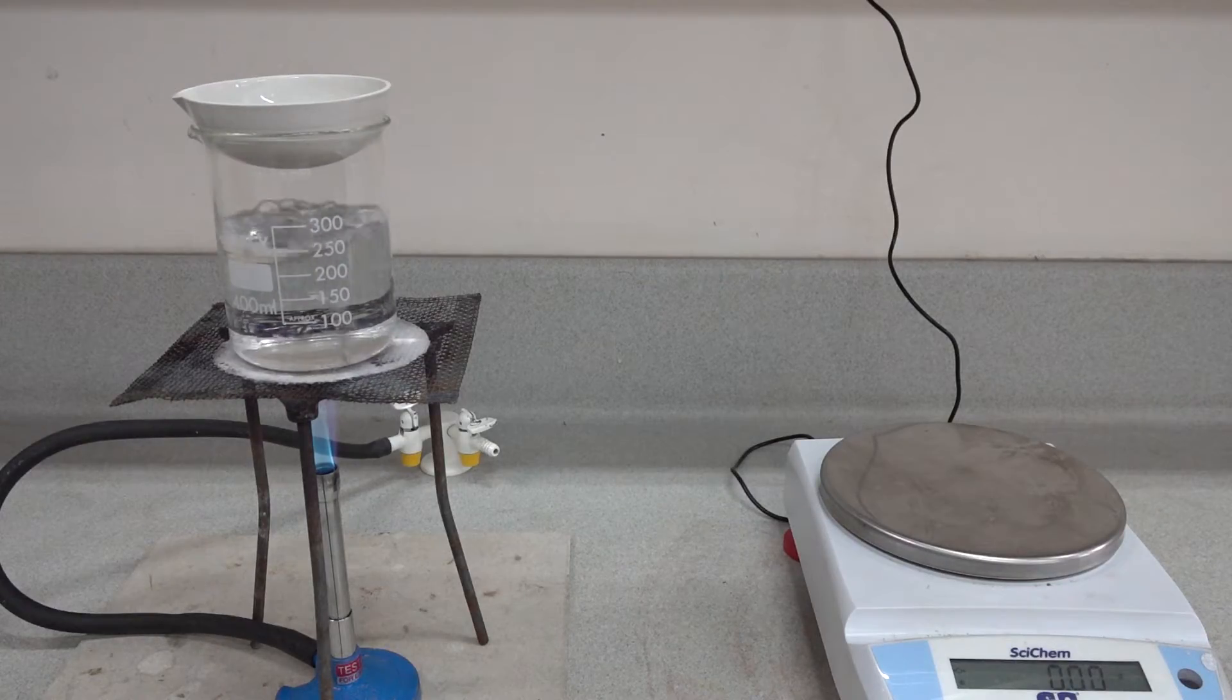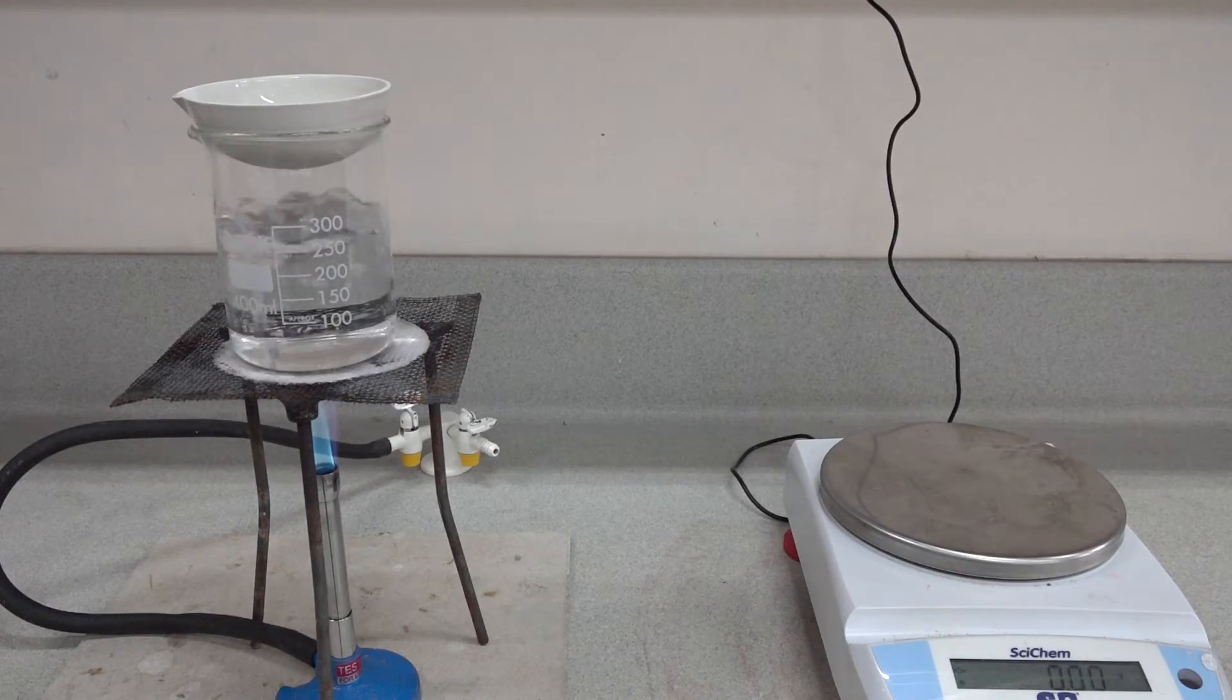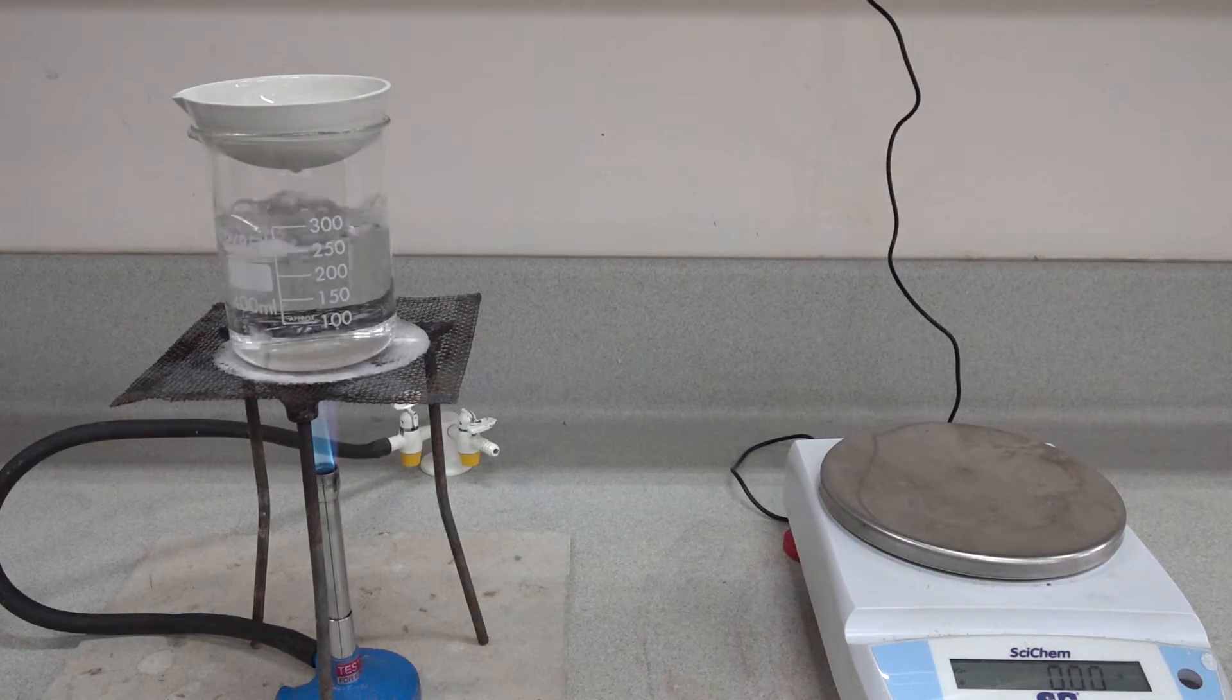To reiterate, if you're going to perform this experiment in a science lesson, it's far easier if you start off with a pre-prepared saturated solution of potassium nitrate and evaporate in a water bath that's allowed to equilibrate at exactly 40 degrees centigrade. That's the time-consuming part of the experiment. It's simply a case then of weighing an empty evaporating basin, transferring some of the potassium nitrate solution into the evaporating basin, evaporating to dryness, and recording mass readings.